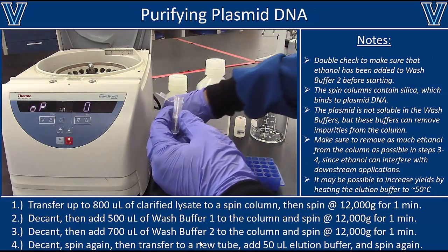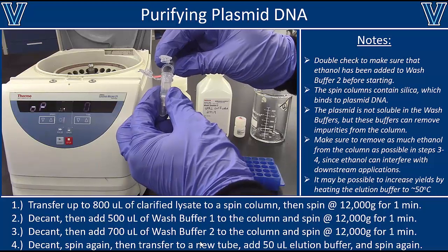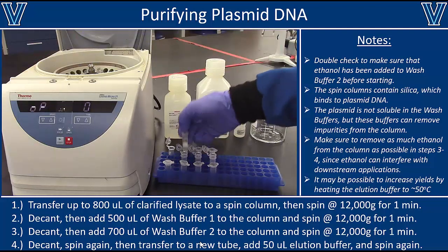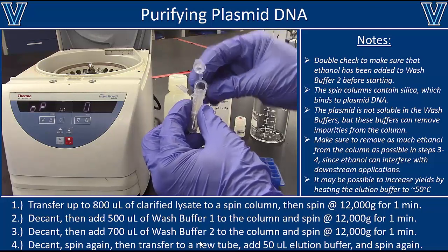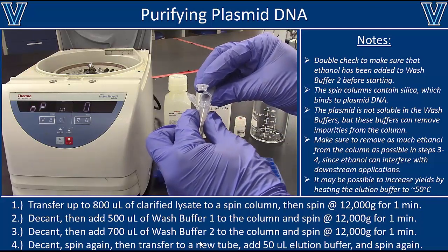All right, now that we've got our samples clarified, the next thing we can do is load the lysate samples onto the spin columns. Here I'm decanting. You can also pipette. The maximum volume of these spin columns is about 800 microliters. I just find it's a little bit quicker to just decant the sample into there.